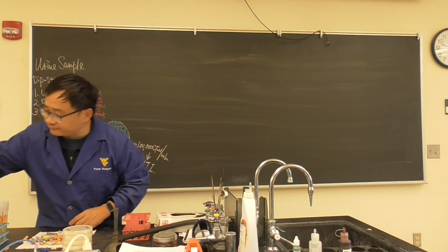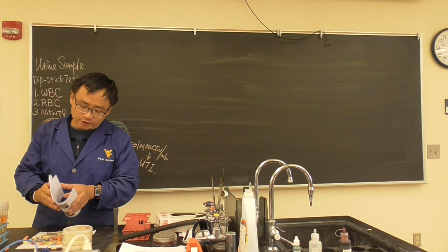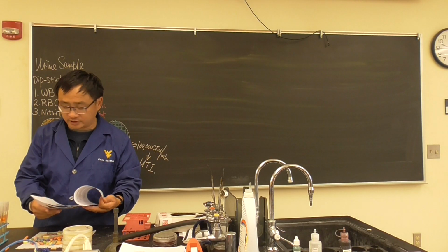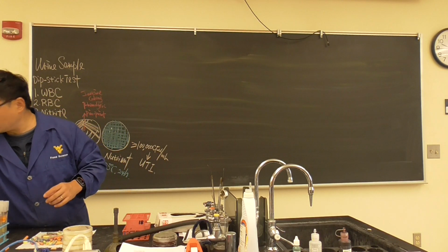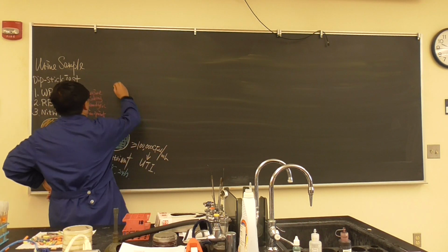Today's lab fact sheet is here, chapter 18, which is extracellular enzymatic activity of bacteria. So this is what we're going to do. We want to mention several things.